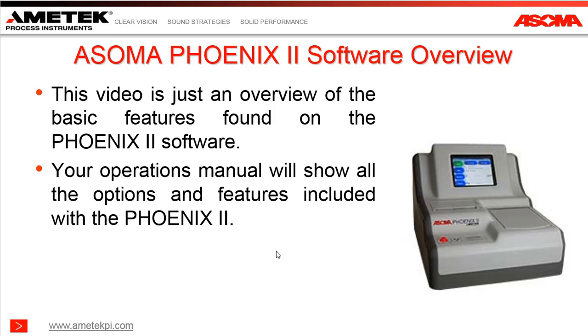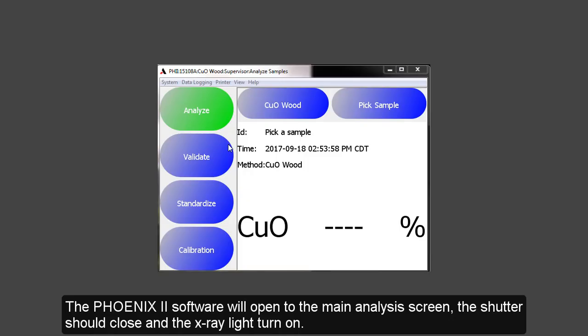This video is just an overview of the basic features found on the Osoma Phoenix 2 software. Your operations manual will show all the options and features included with the Phoenix 2.